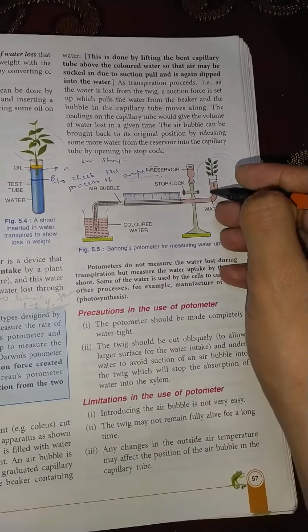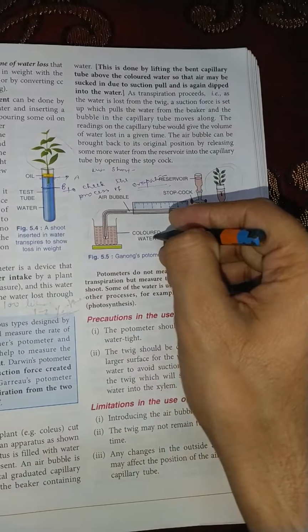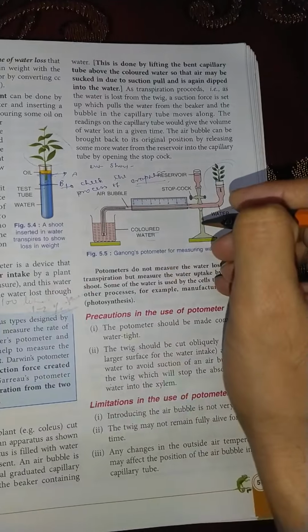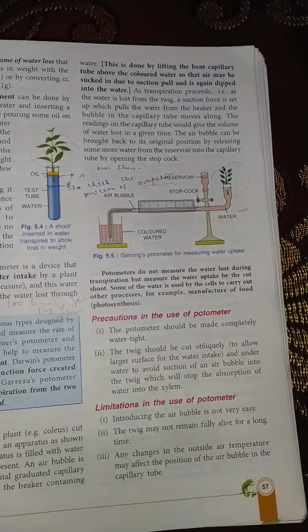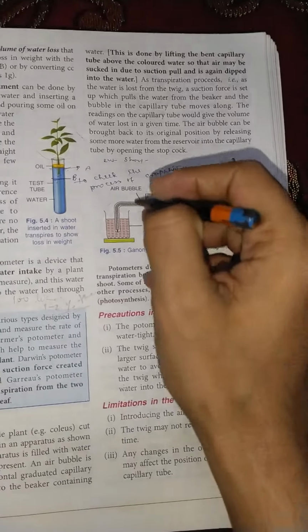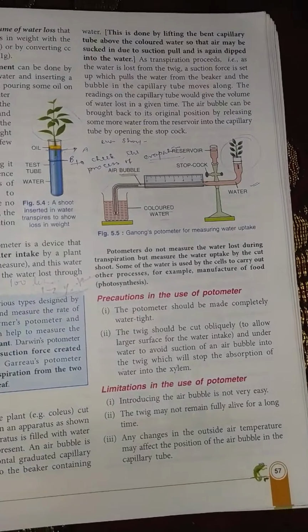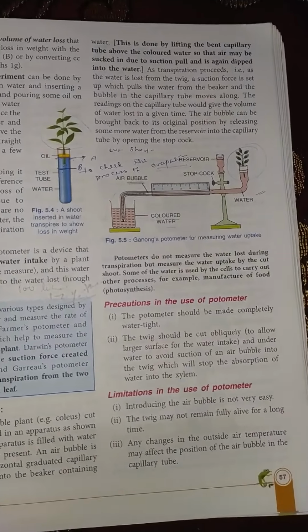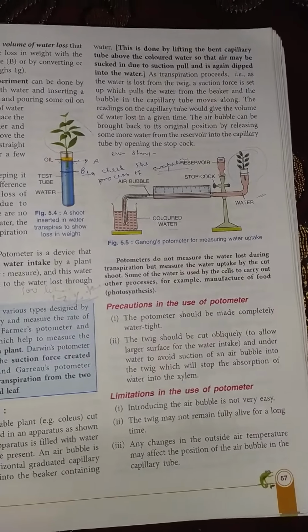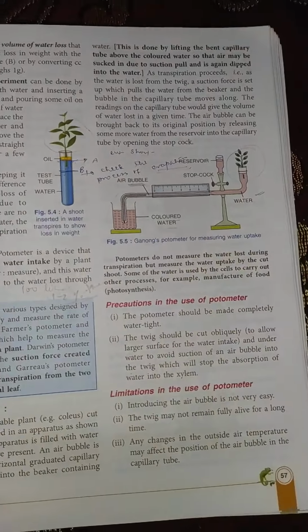Now at one end we will have a beaker that is totally filled with colored water. The reason for taking colored water is that the whole experiment depends upon the air bubble, and the air bubble is transparent. So we take colored water so that we can see the movement of the air bubble through the capillary tube.